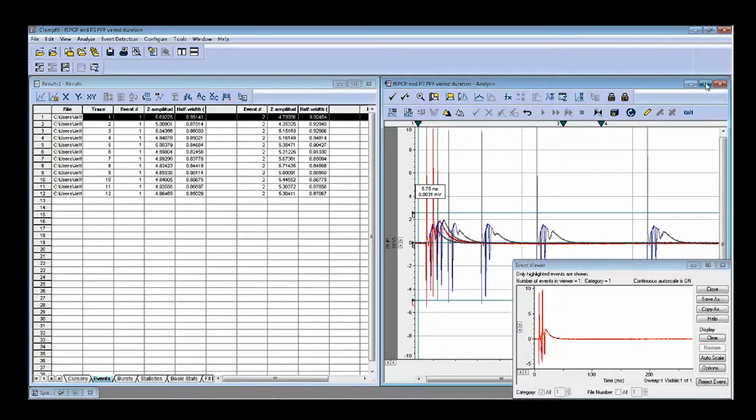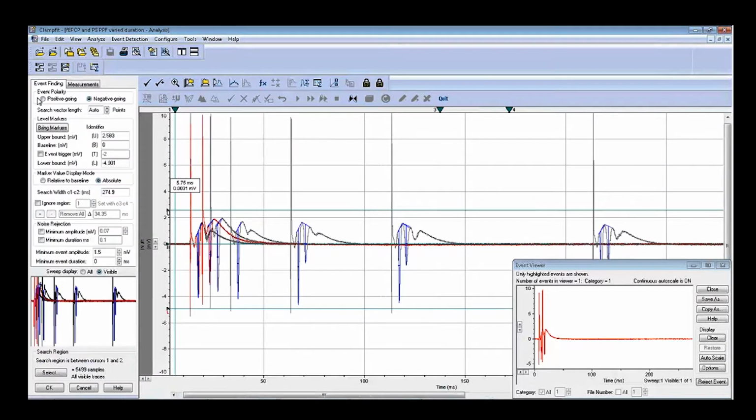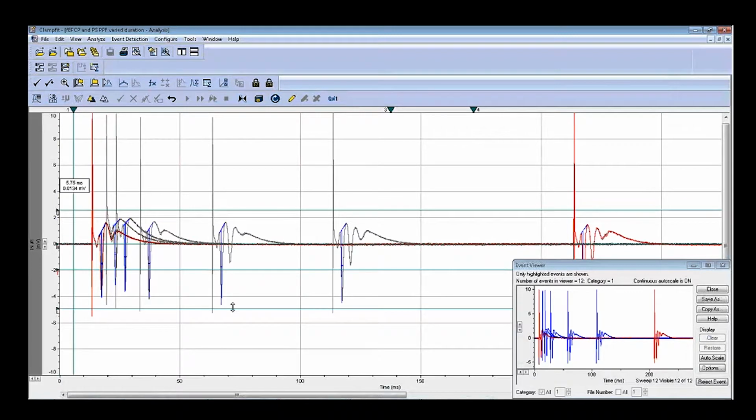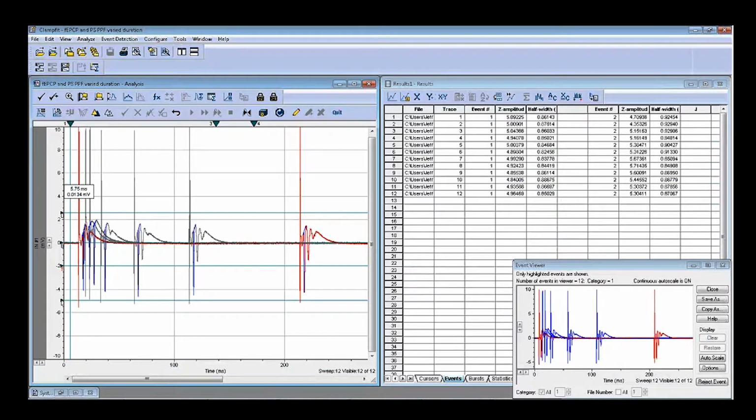All right. Now, you can also do one more time for fine-tuning another way. Like I told you, you can do this one. You can get the event trigger, right? Put it here, because you want to measure only the largest spike here. Even though you don't do anything here, it is fine. And hit OK. And we do this one. Now you can see only the spike that crosses this first line will be calculated. Now you can see the data, and the data is also beautiful too.